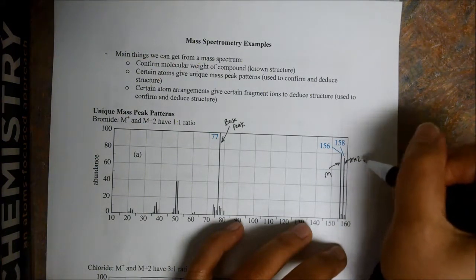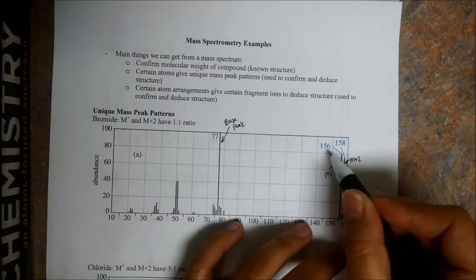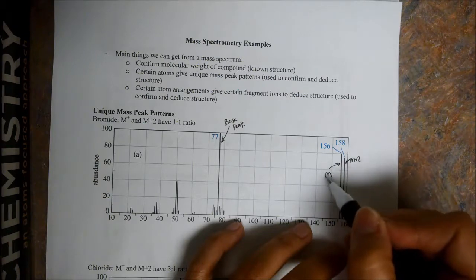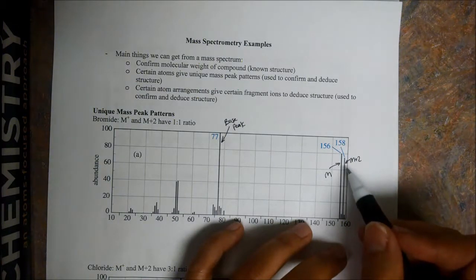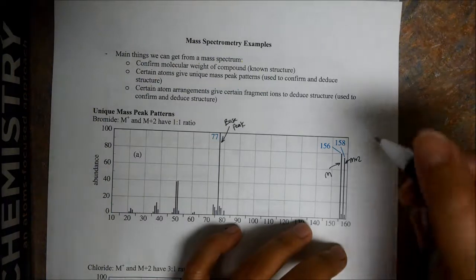What does the M mean again, right? The molecular ion, this corresponds to the fact that this mass peak has the same mass as our original compound. Okay, that's what the molecular ion is. And so just adding 2 units to that, you can see that these peaks are present in a 1-to-1 ratio.